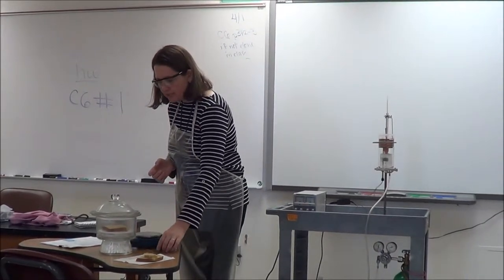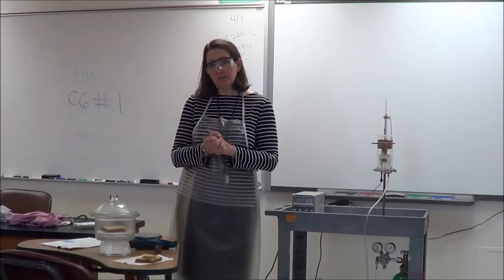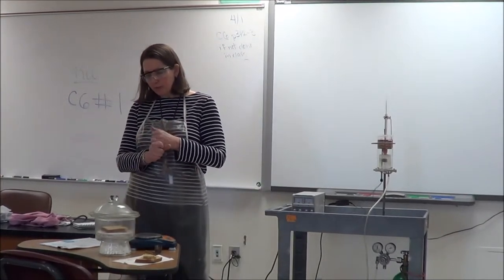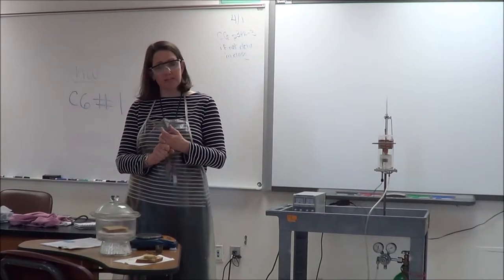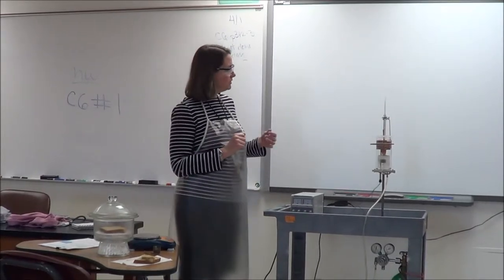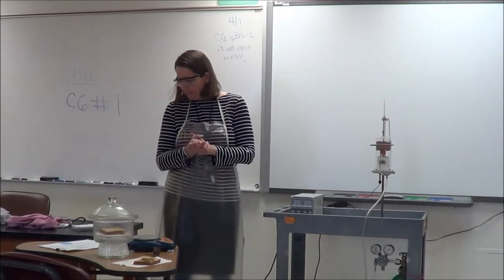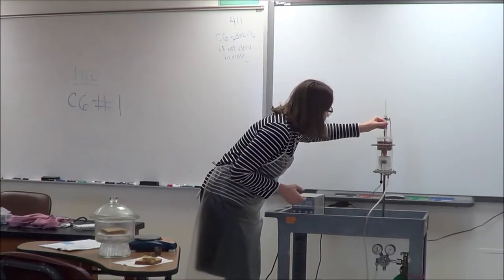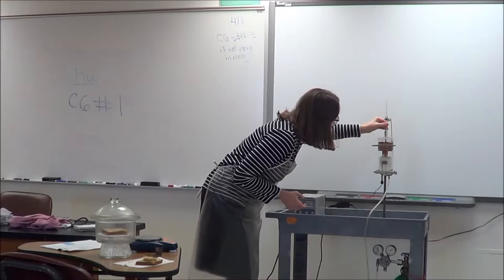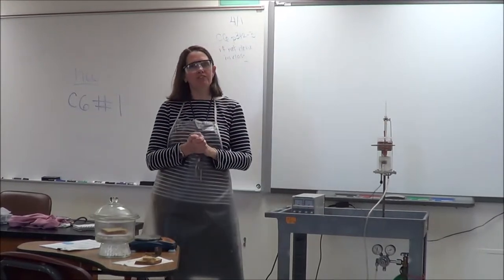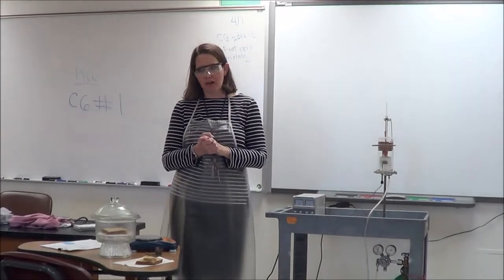The next two things on the data table we won't be able to determine until after the experiment, which will be the mass of the bread and nickel crucible after combustion, and then the mass of the bread burned. We do need to find the temperature of the water before we start the combustion. We've got a thermometer here sitting in the water, and that temperature is 22.5 degrees Celsius. So record that in your data table.